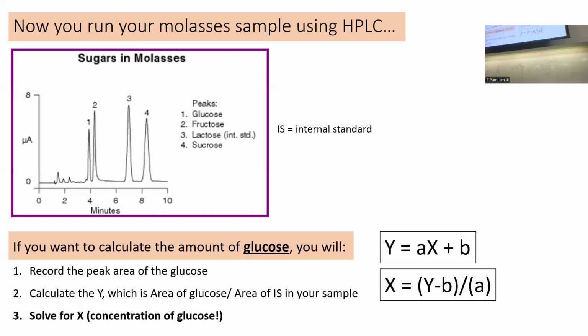Using an internal standard, is that an example of spiking? No. Spiking is when, in the decaf sample, you had those three peaks that were very close to each other where caffeine should be. Let's say you have 3, 4 peaks where the standard should come up, where caffeine should come up. And you don't have a photodiode array detector, which gives a fingerprint.